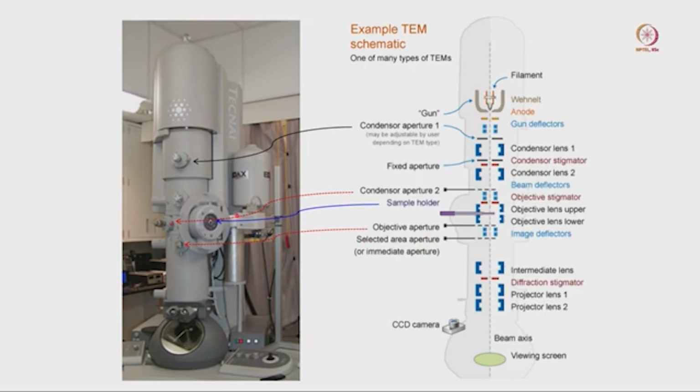I mentioned that this is the goniometer, shown here, and this is our sample holder. The sample holder is a rod of more than 1.5 feet long, where the sample will stay inside, at the position of the optical axis.